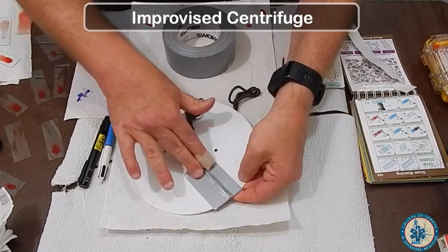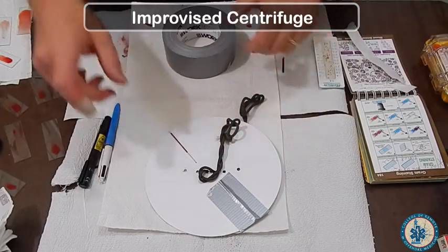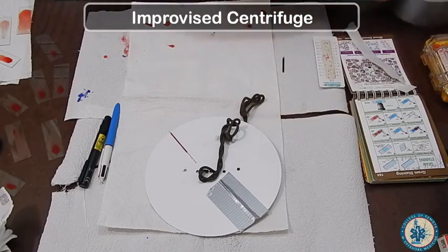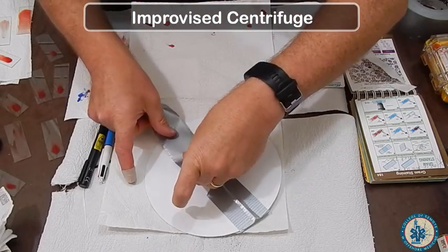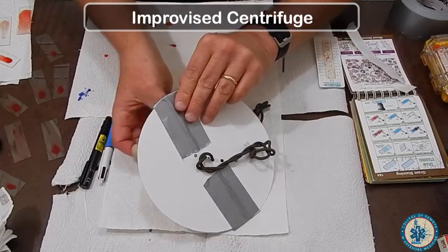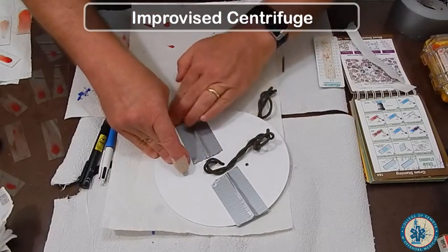This will keep your capillary tube from flying out. Notice that I am taping the capillary tube exactly opposite the first one. Again, use 100 mile an hour tape or gaffer tape — tape it down making sure you wrap the edge of the tape around so the capillary tube does not fly off.